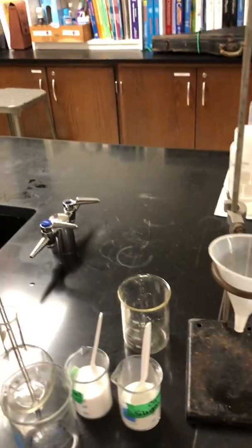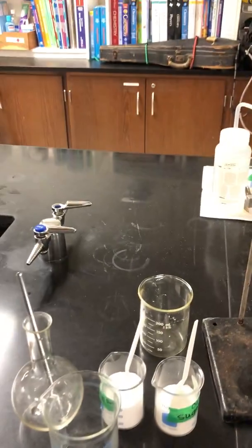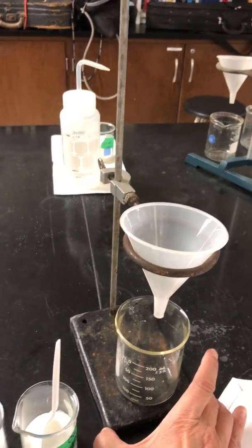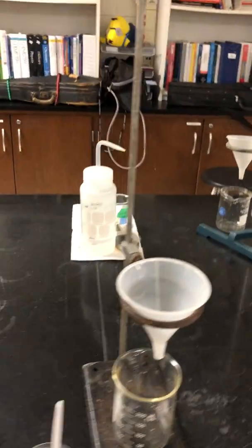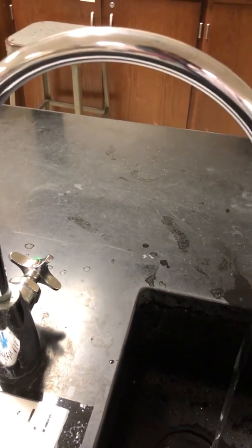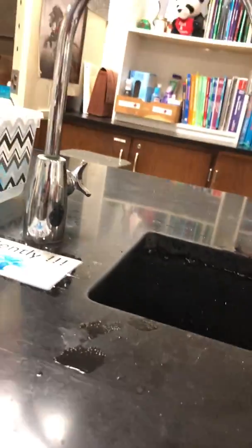Here we go. Measure approximately 150 milliliters of water in a beaker. Let's do that. Set up our filtration system. Okay, because it shows you how to do it. Nice, let's get our 150 mils of water. Gently. Okay. Actually, that's pretty spot on. All right. And it said approximately, so we're good.